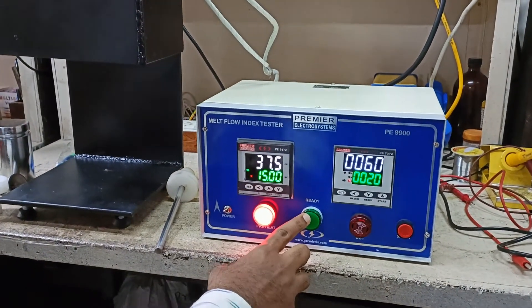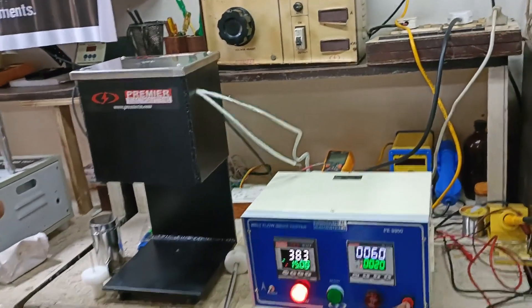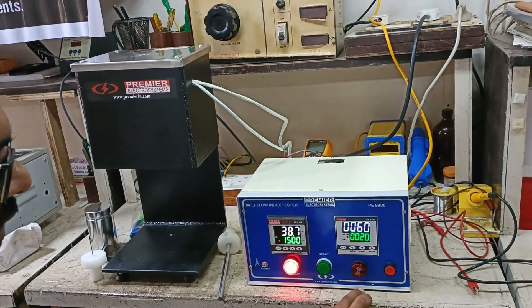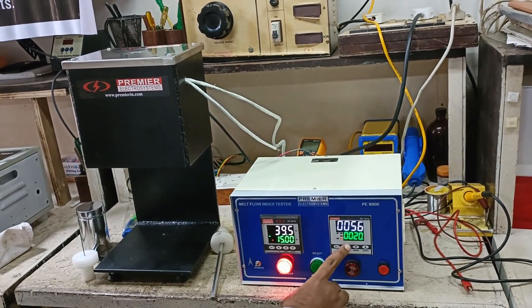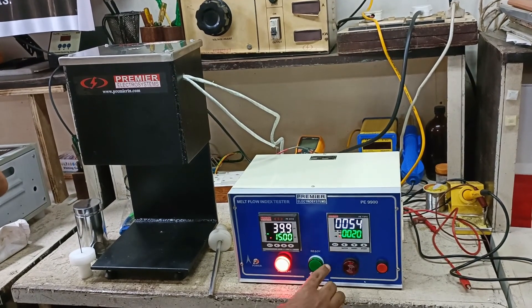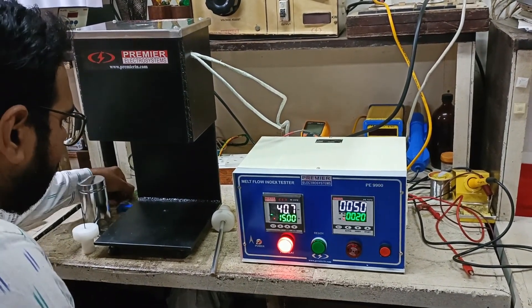Once the ready LED glows, you can start loading the material and press the start button. Once you press the start button, after every 60 seconds or 240 seconds — whatever your standard requires — it will give a buzzer to indicate the cutting of the material.